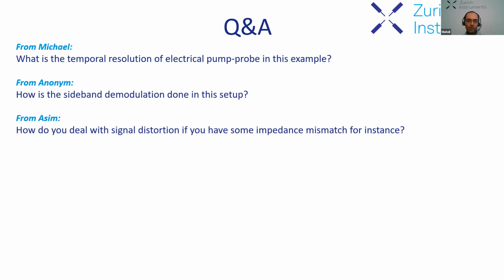Well, that depends on the frequency level we have, and also the transient of the pulses. In case the pulses are sharp, like the situation that I showed you in the tutorial, it means that these pulses have high frequency content, and then the impedance mismatch would be important. One solution is to smooth the pulse by using some other type of pulses, and that's why an arbitrary waveform generator can be useful. The other way is to match the impedance of the systems by some impedance matching network or circuits.